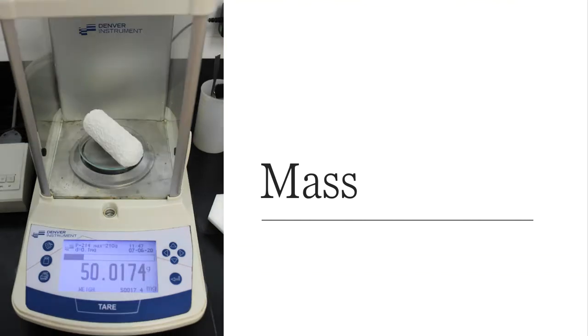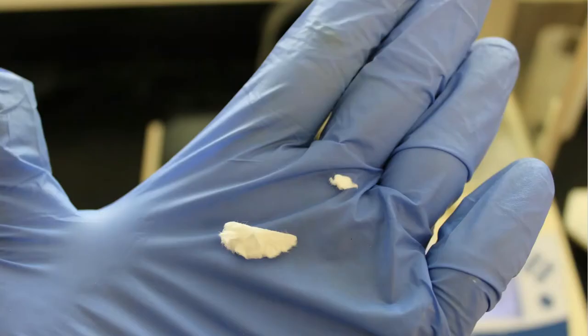We need to get a mass of the dried thimble, cotton, and nuts. And this is the mass of the dried thimble, cotton, and nuts. And that's 50.0174. Keep in mind that I did get little fiber pieces that came off of that membrane because I was trying to remove it with the tweezers, and this got pulled off. So I did include that in the mass, but was this the only pieces that were lost? I'm not really sure. But I need to make that note in a lab notebook.